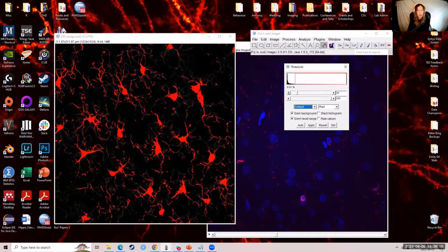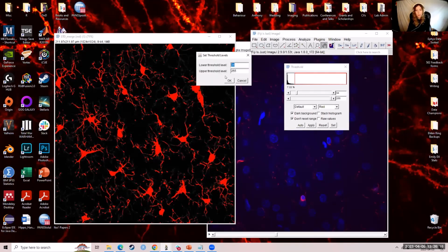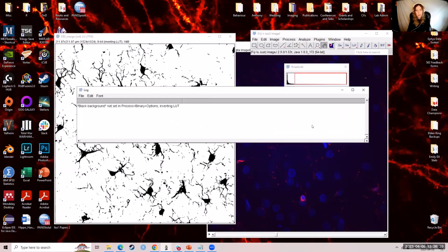And for my actual analysis, I do obsess over these settings a bit more than I will today, but this is an approximation. So you want to click set. It'll bring up this box. It's like, are you sure? Okay. And then we will click apply.